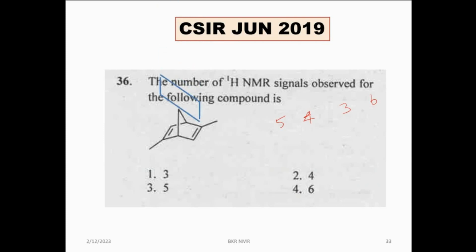So I can cut the molecule like this. The molecule cut பண்ணலாமா? Or I can use an axis of symmetry. Rotate பண்ணா இது இங்க வரும், இது இங்க போயிடும். அப்படி பார்த்தா this and this are same. So signal 1. இந்த மாலிகுல் நம்ம எப்படி வெட்டுறோம்? இப்படி வெட்டினா இந்த half சேம் ஆயிரும். அப்படி சேம் ஆச்சுன்னா இதுவும் சேமா இருக்கும்.